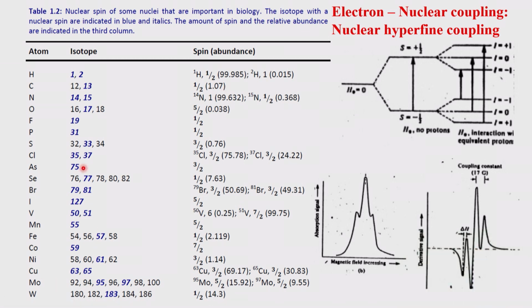I again draw your attention to the table, because I am explaining with respect to it. When you take carbon 12, which is 99%, it can be ignored. Carbon 13 is only 1%, it should be considered, but 1% out of the 100 you will not be able to see the signals much. If you make it 20% enrichment of carbon 13 or above 10%, you can start seeing the coupling; otherwise you will not see the coupling.